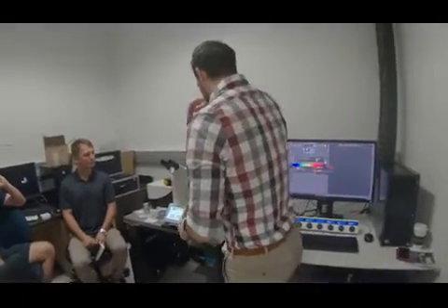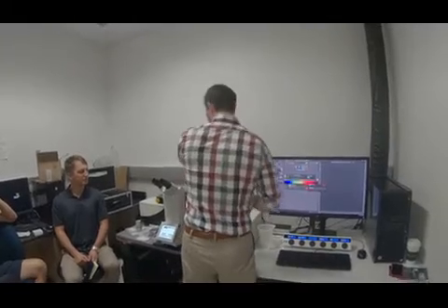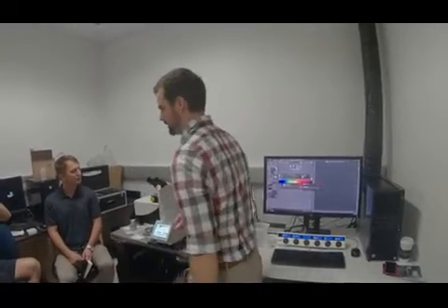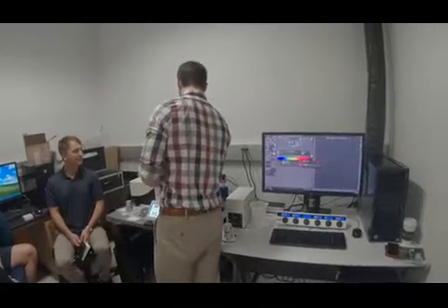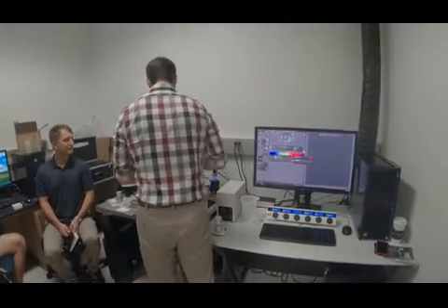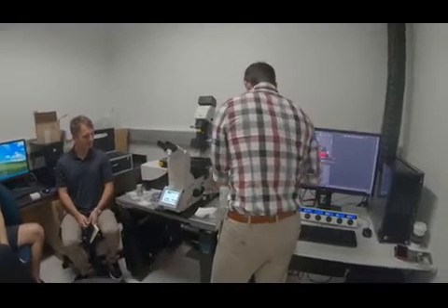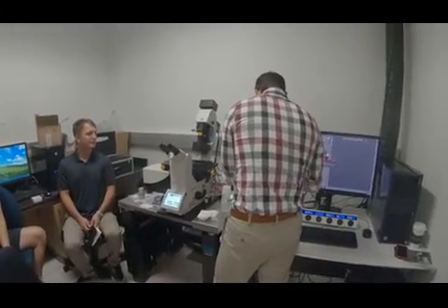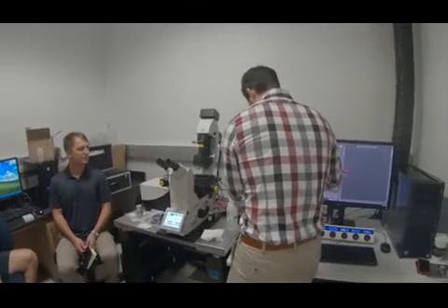Okay, so this is the SP8 light sheet. Is everyone familiar with the principle of light sheet?